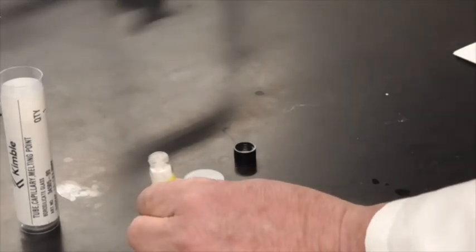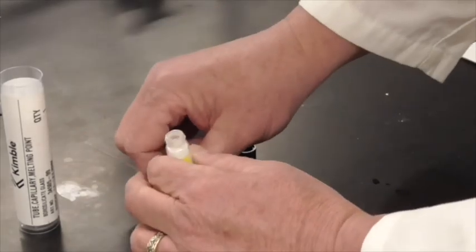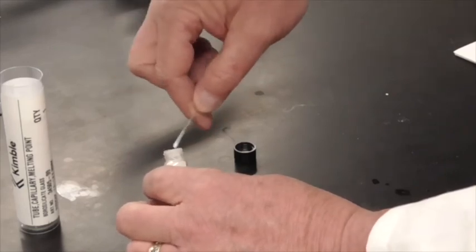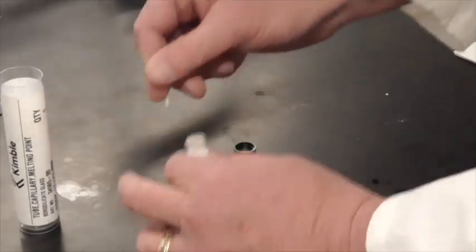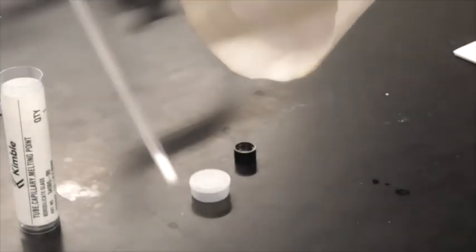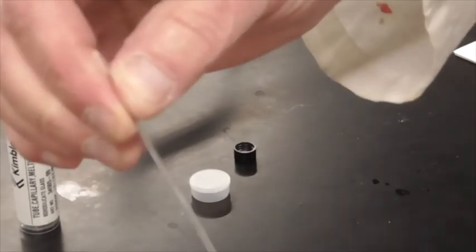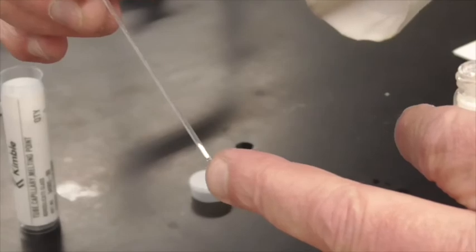Nothing's going to go in the closed end, so then we're just going to tap it. Do that a couple times. We can see, bring it up here, that our capillary tube has some sample in the end of it. That's the closed end right there.